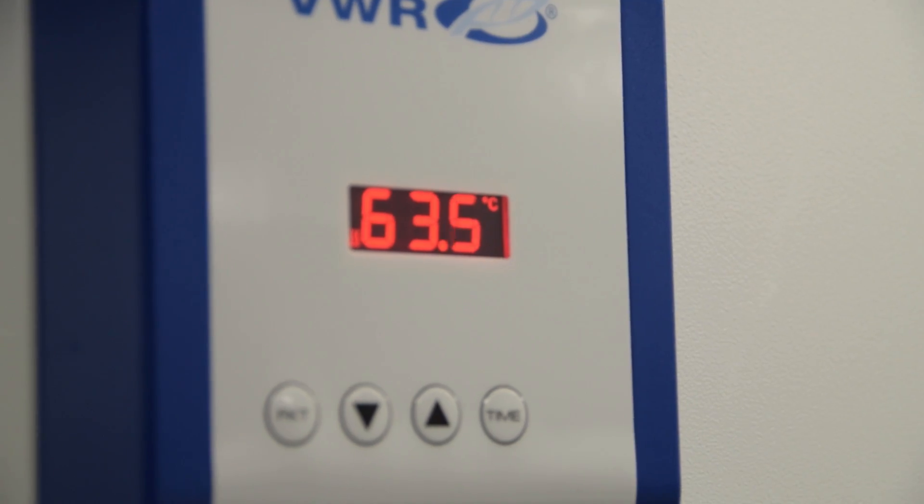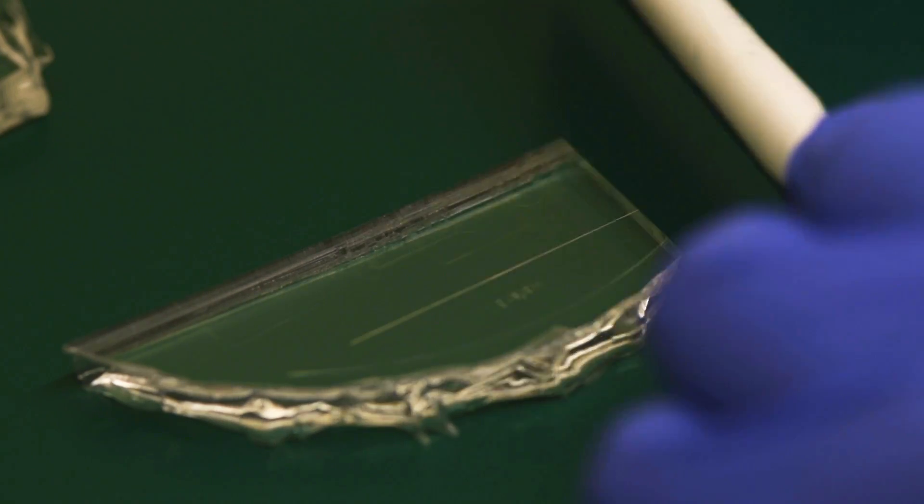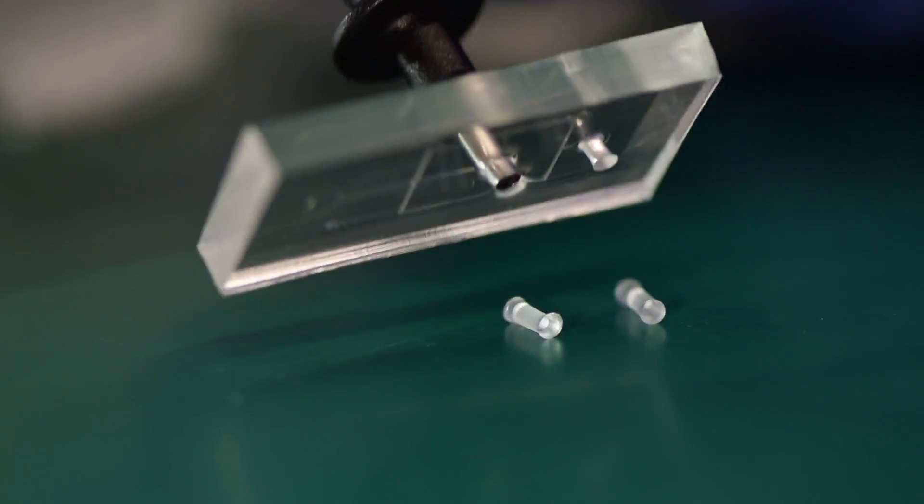After an hour, we can take out the PDMS which has become solid. We take away the aluminum and the mold, and cut out of the PDMS the area around the circuit we want. Now we just need to make holes with a punch for the liquid's inlets and outlets.